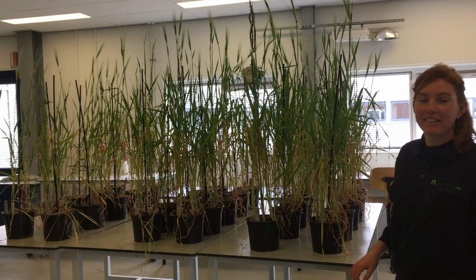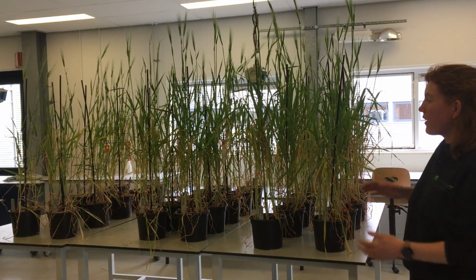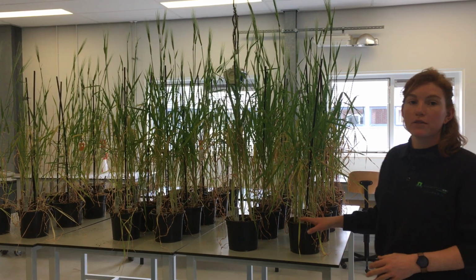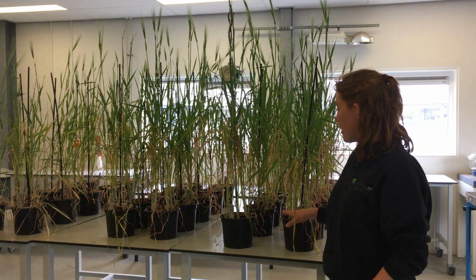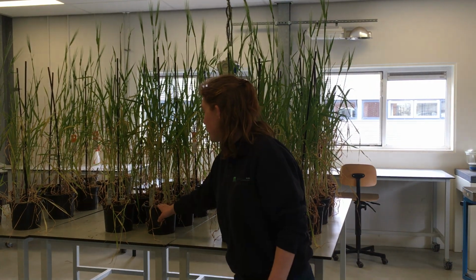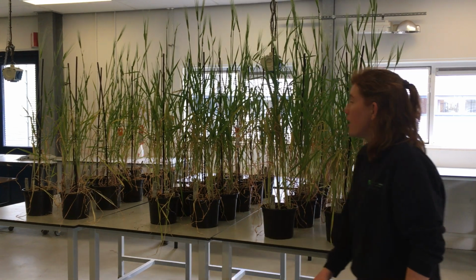Hello everybody. Here is Pauline. She will introduce you to the experiment. Yeah, so here we have one replicate of plants. There are 3 different soil types. This is rich soil, it's just regular potting soil, medium, and poor soil, which is mainly sand.